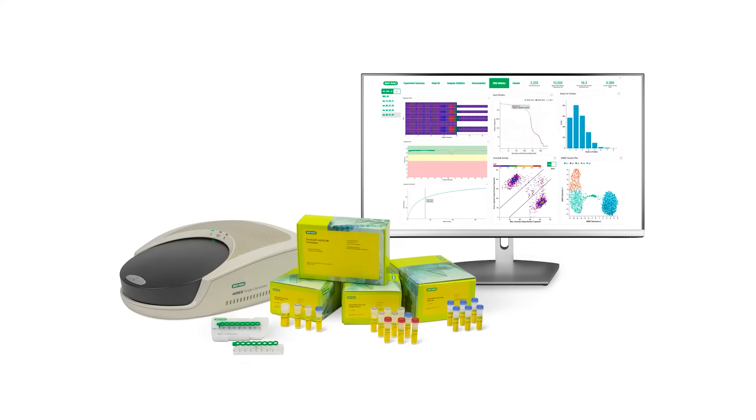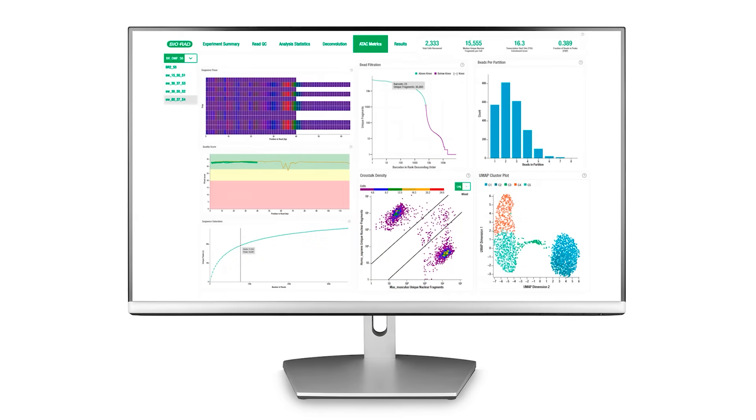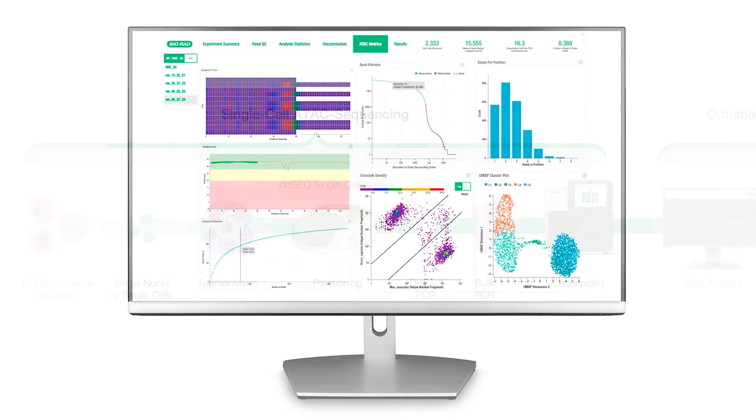Omnition Analysis Software is a companion bioinformatics pipeline for Bio-Rad single-cell assays. This video provides an overview of how to run the ATAC Data Analysis module with Omnition version 1.0.0.